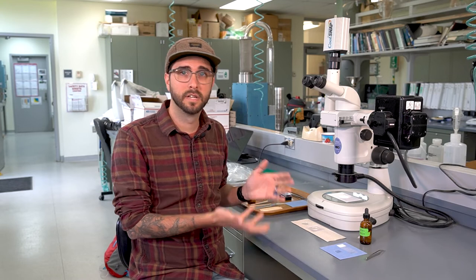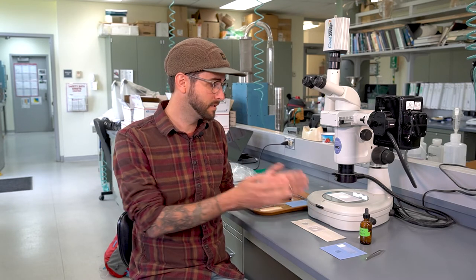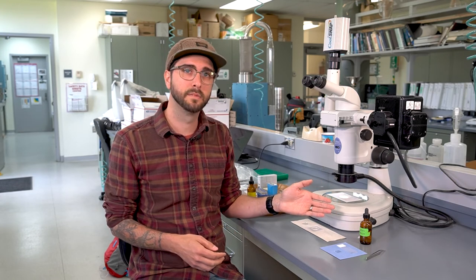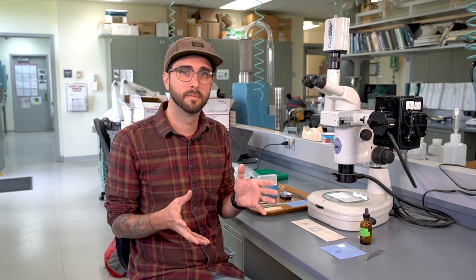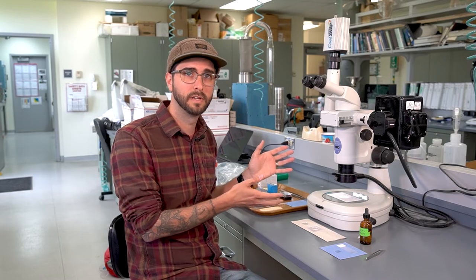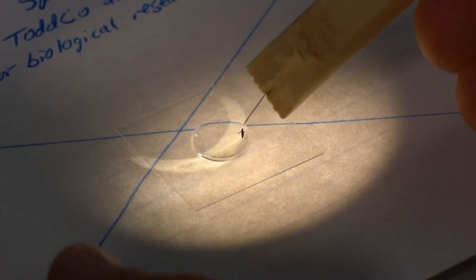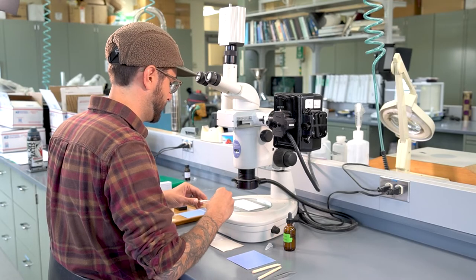Now that our thrips specimens have cleared — which can take several days depending on the color of the thrips — we can move on to slide mounting. To do this, we need a glass microscope slide, a cover slip, and also mounting medium, which keeps the thrips in place and preserves it over time. This whole process is done under a dissecting microscope where we can see the specimen more clearly and move around appendages like antennae, wings, and legs so that they're not covering up the body.